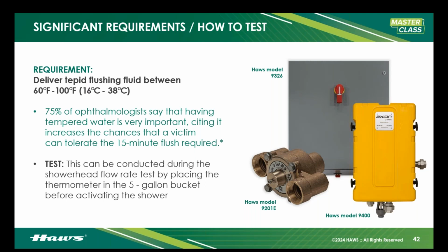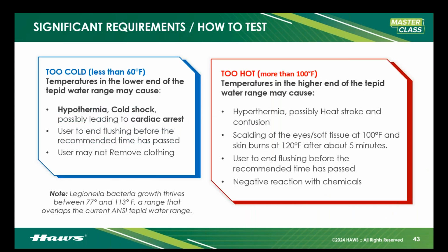And that temperature range is doing a couple things. First, it's ensuring you're not going to get hypothermia. You're not going to get cold too fast. Wind chill is a huge factor. There's so many things. Cold shock is possible, cardiac arrest. And consider this too, if you are dealing with corrosives, the insulation on your body is being actively corroded and damaged. To step under 60 degree and under, like cold, cold water, you are just going to bleed heat very quickly. The likelihood of hypothermia or cold shock before or on your way to the hospital is highly likely.